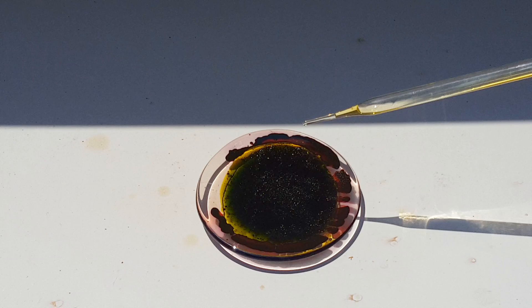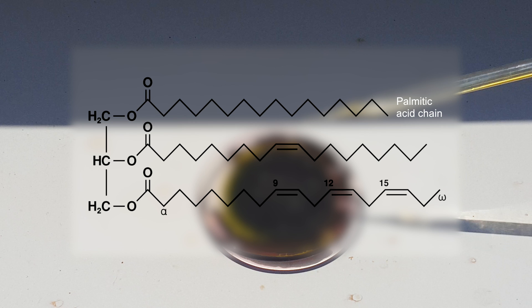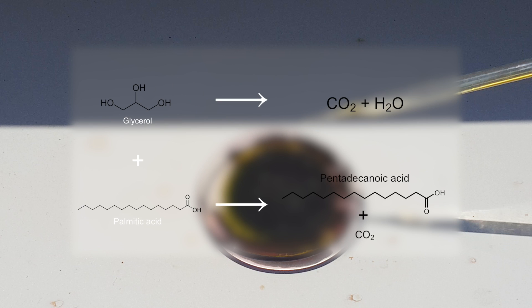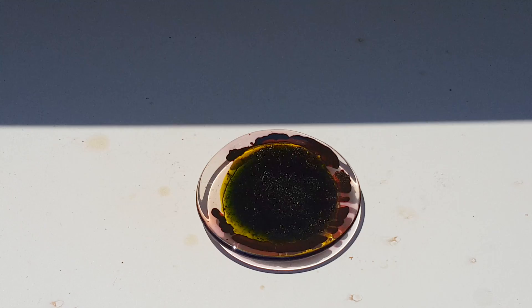Next, I wanted to see how Manganese Heptoxide would react with a biochemical molecule in preparation for the chicken flesh later on in this video, so I decided to use some extra virgin olive oil. The reactions here are a bit beyond my scope, as I'm not entirely sure of the many mechanisms possible for the oxidation of the triglycerides and resulting fatty acids. In a general triglyceride made of only palmitic acid, I'd expect the Manganese Heptoxide to cleave the glycerol from the triglyceride first, leaving glycerol and the fatty acids. Then both the glycerol and the different fatty acids would react separately with the Manganese Heptoxide. The fatty acids are oxidized into smaller chains, producing carbon dioxide and water, while the glycerol is decomposed directly into CO₂ and water.